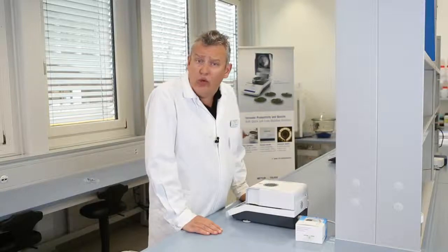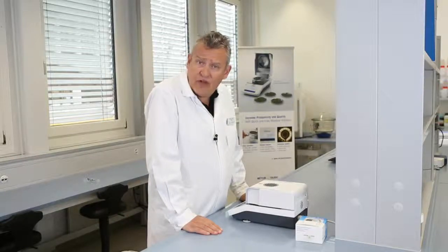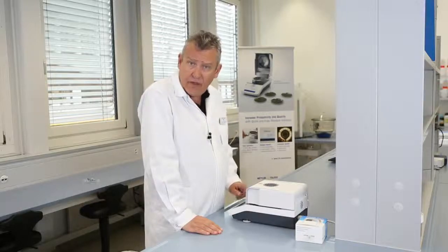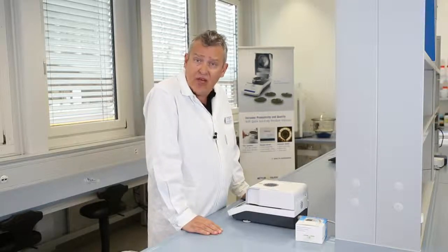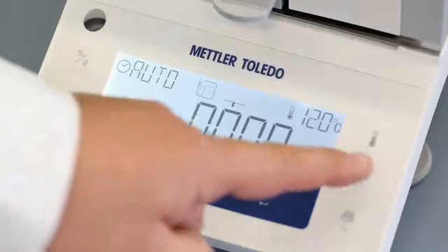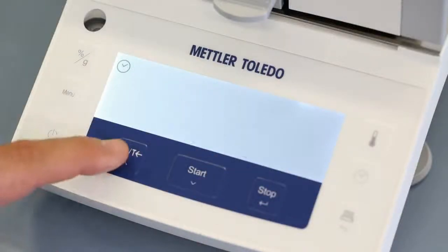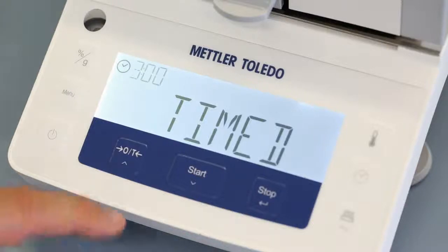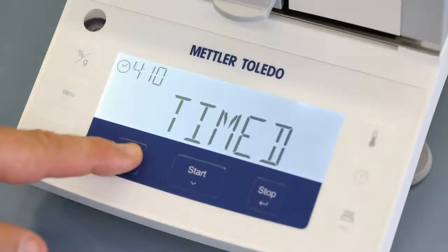You may also want to change the switch-off criterion from automatic to timed switch-off, and select the desired drying time. To do this, press the time button to adjust, change to timed, and press confirm.